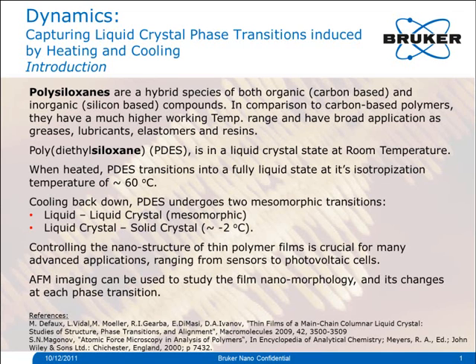Polydiethylsiloxane, PDES, is in a liquid crystal state at room temperature. When heated, PDES transitions into a fully liquid state at its isotropization temperature of about 60 degrees C. Cooling back down, PDES undergoes two mesomorphic transitions: liquid to liquid crystal, and liquid crystal to solid crystal at about minus 2 degrees C. Controlling the nanostructure of thin polymer films is crucial for many advanced applications, ranging from sensors to photovoltaic cells. AFM imaging can be used to study the film nanomorphology and its changes at each phase transition.